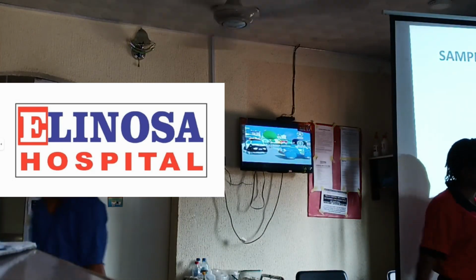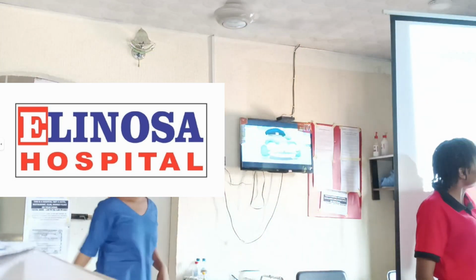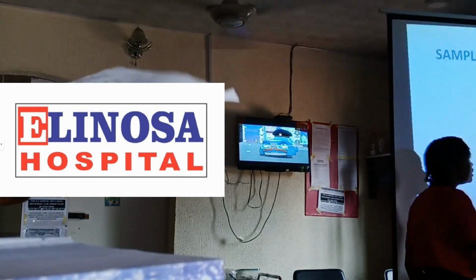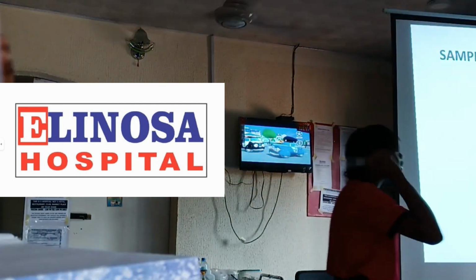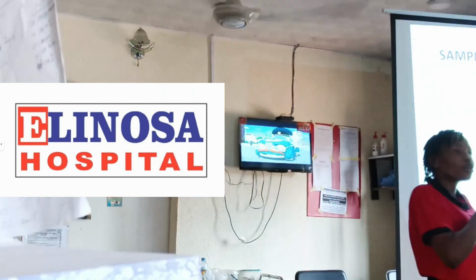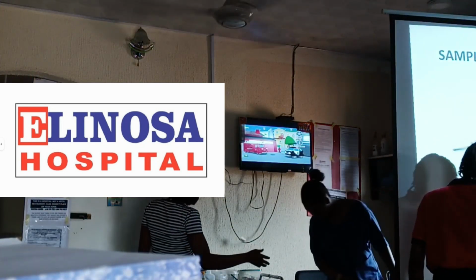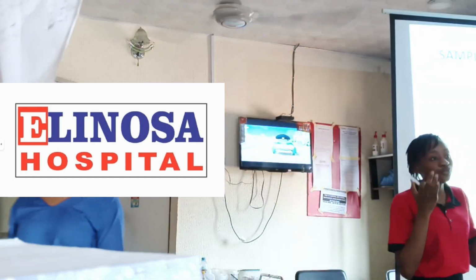By the time they are done with it, like I said just now, they put it inside the freezing tube. For example, if they should bring that sample into this laboratory, you will have to ask them for a fixative known as formalin that will keep the tissue as lifelike as possible. Because once a tissue has been removed from the normal source, like in the body, it will start deteriorating. And there is no way you can test that sample if the tissue or the organ has started deteriorating or decaying. That's the reason why you have to tell them to put it inside a fixative, or you call it formalin.